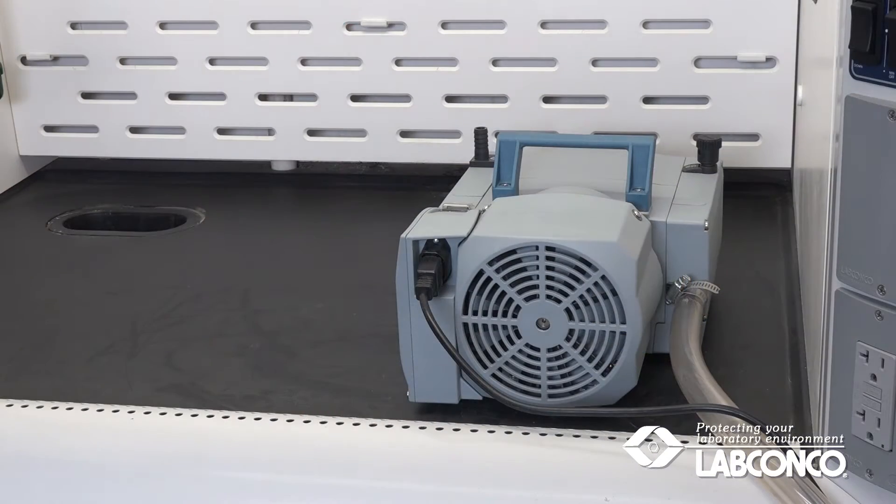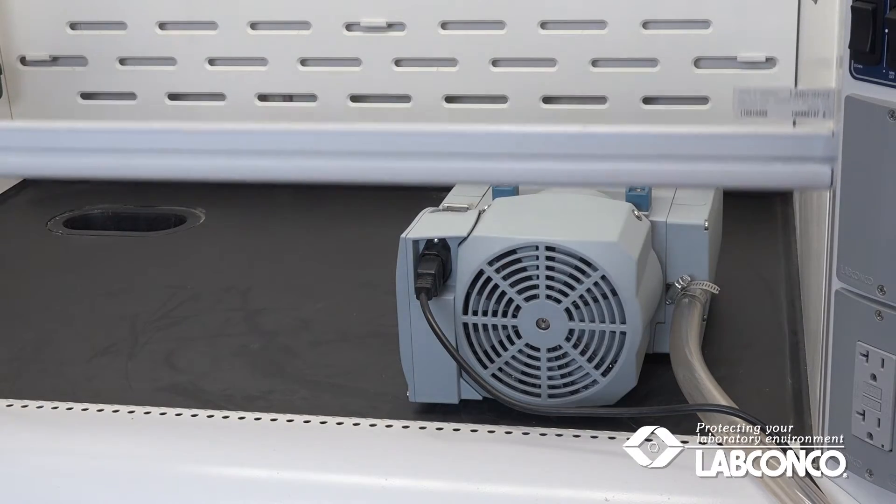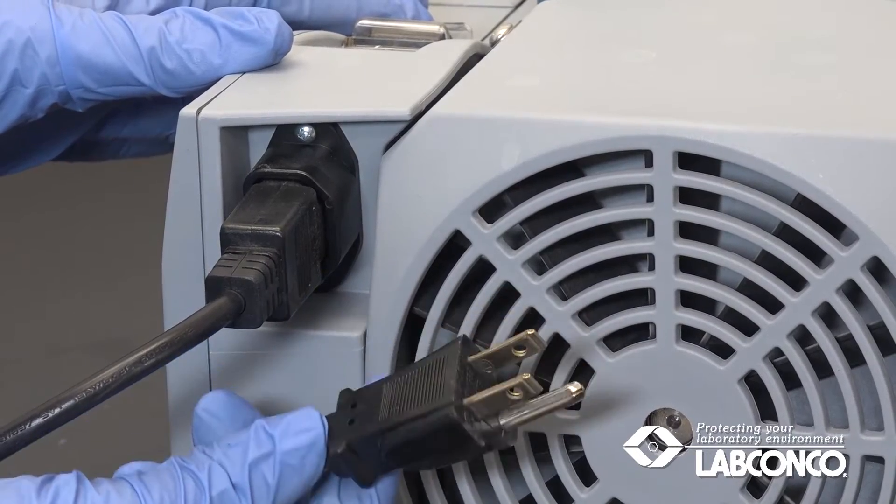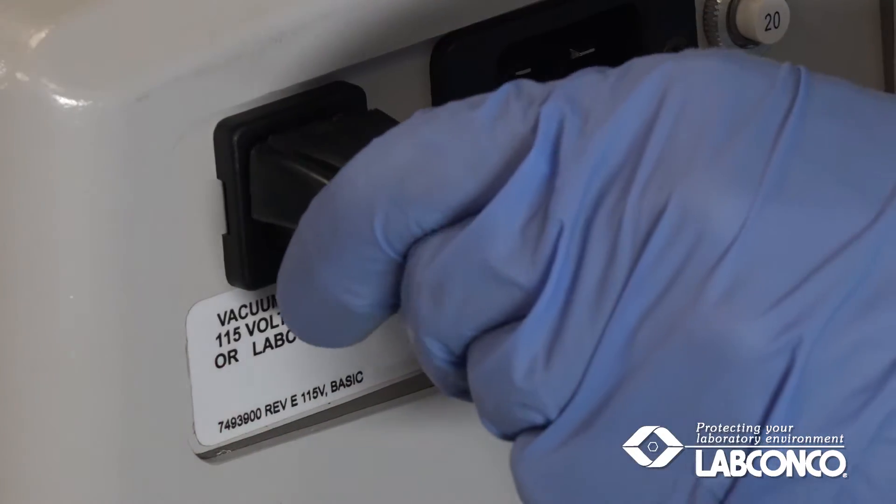The pump should be vented into or located within a fume hood. It must also be plugged into the back of the RapidVap to allow automatic start of the pump.